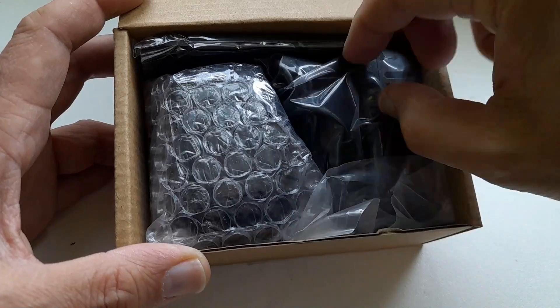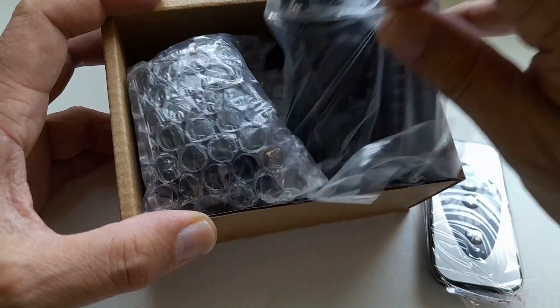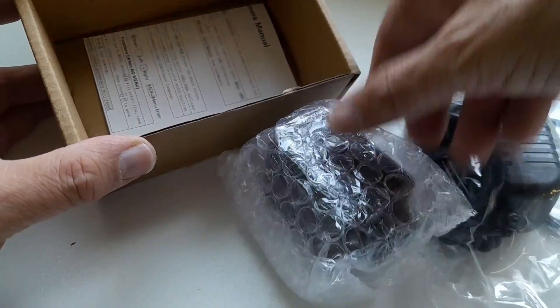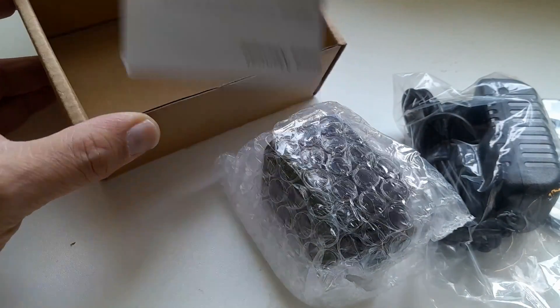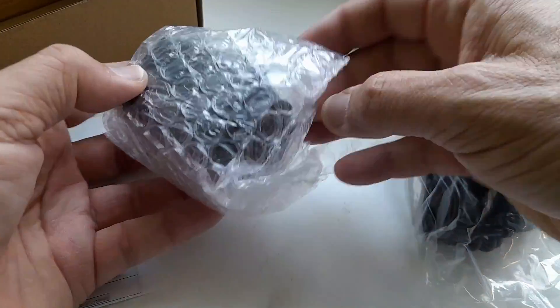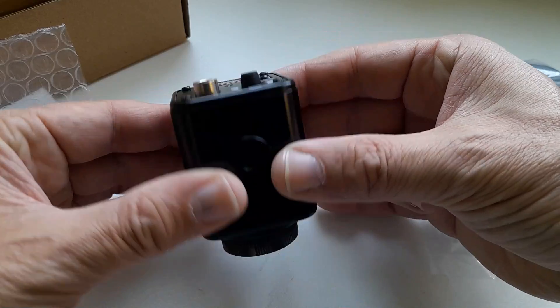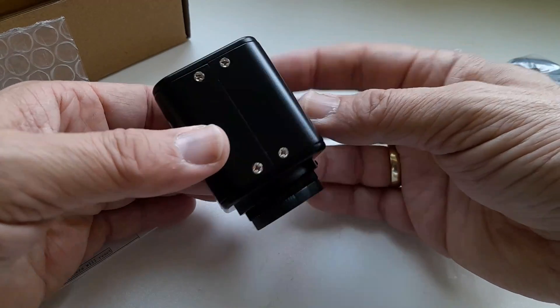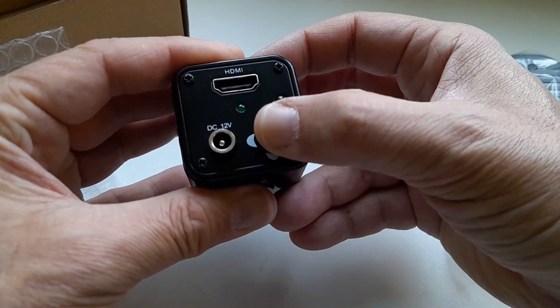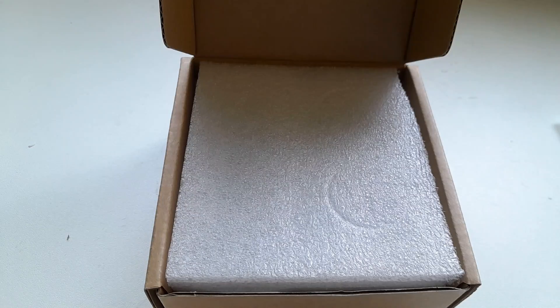Let's start with unpacking the camera. It came in a very inconspicuous box. We've got of course the power supply adapter, the infrared remote control, and this here is the camera — bubble wrapped — and a small single-page instruction manual, though it's pretty self-explanatory. The camera is made fully of metal. The interface in the back is quite straightforward: a power supply, a little joystick, the HDMI port, and it requires a 12-volt external power supply.